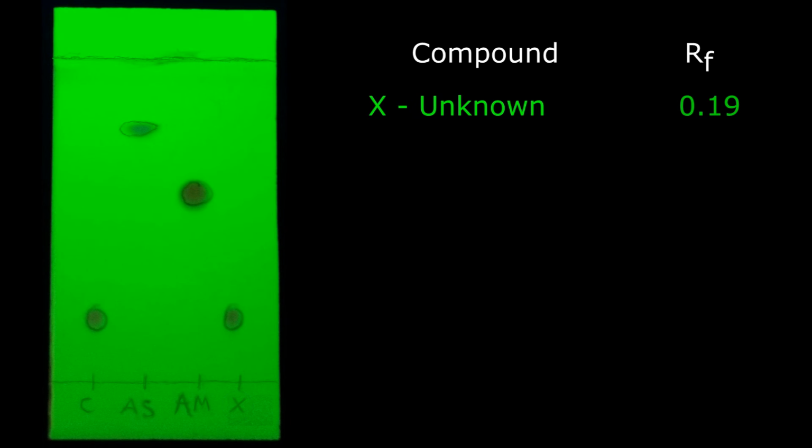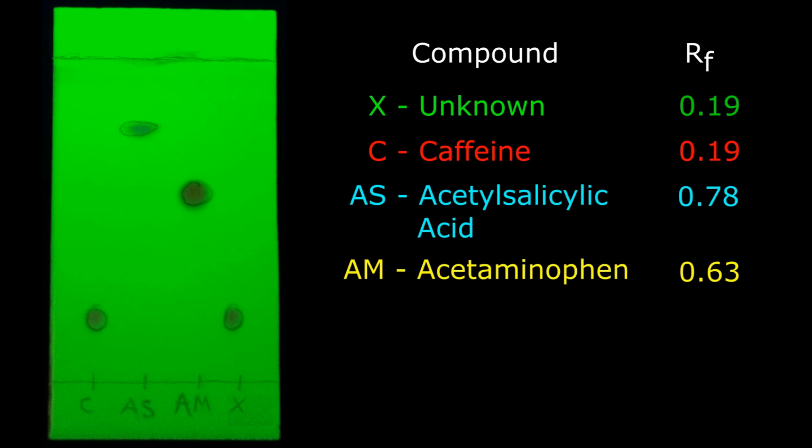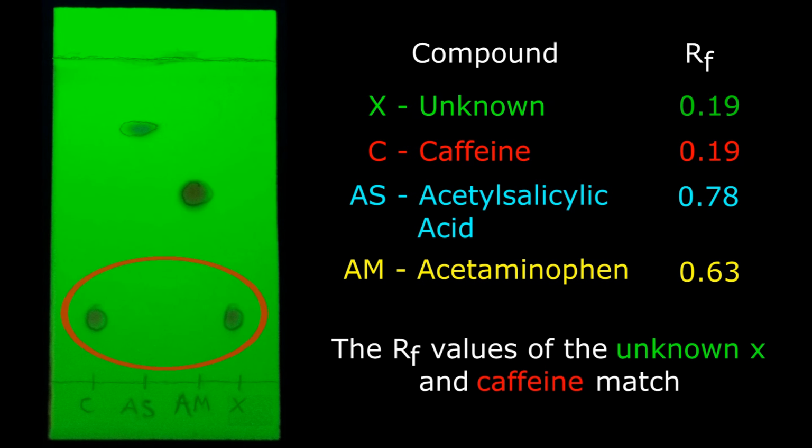For example, consider if you were required to identify an unknown sample as caffeine, acetylsalicylic acid, or acetaminophen. Since the three possible compounds vary in polarity, you could perform a TLC analysis to identify the unknown by matching its RF value to the correct known sample.